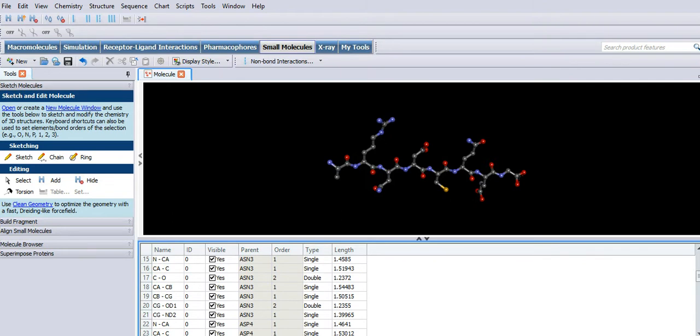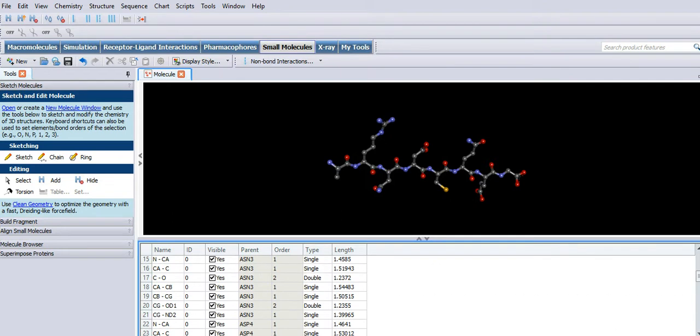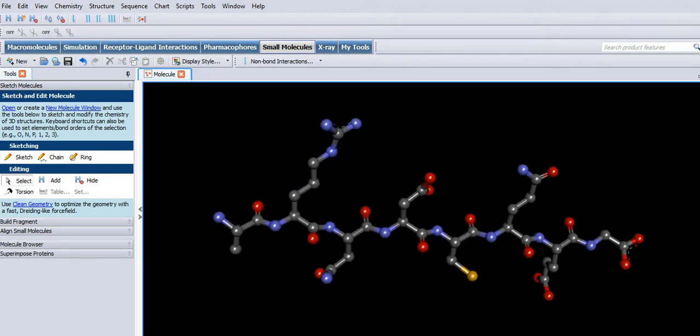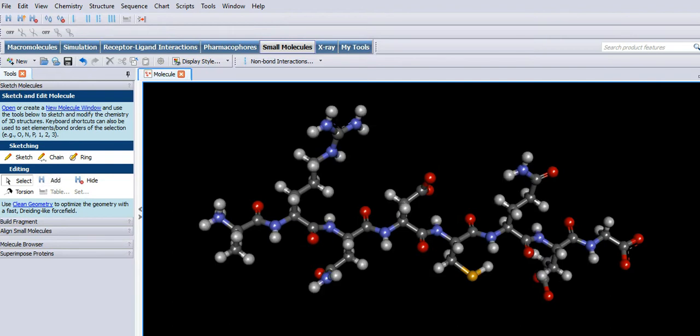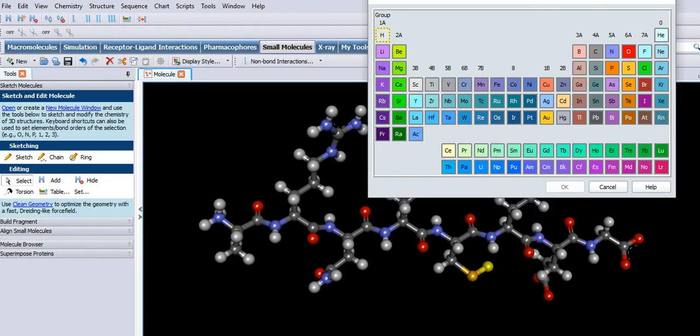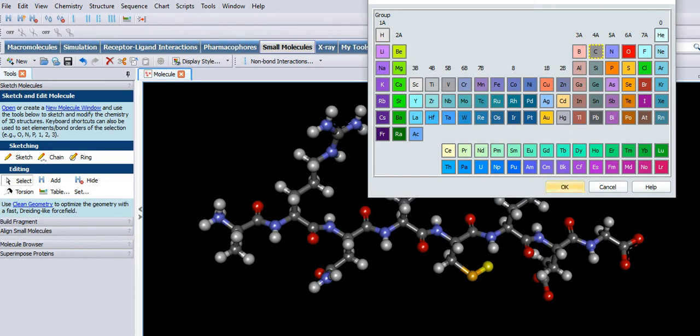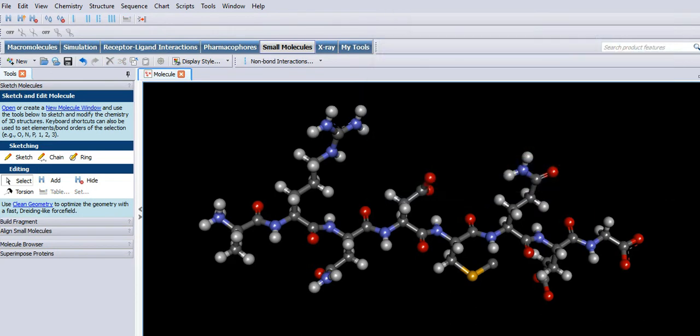I'm going to move on to polynucleotides. Close... Oh, just had a thought before looking at clean geometry. Put the hydrogens back on. I'm thinking about what would happen if I methylated that. Self from the system, go to table to a carbon. Okay, increase upon this. It's not showing hydrogen.